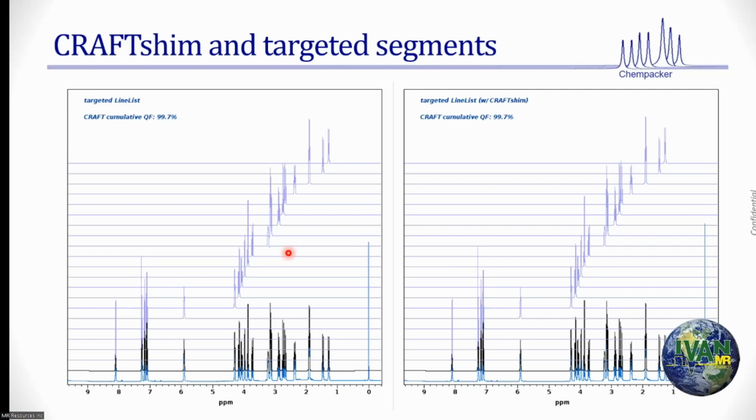I want it to be strychnine because somebody took a bottle of strychnine, made a sample, and ran a spectrum for me 20 years ago. I haven't run a spectrum myself, George. Somebody ran a spectrum for me. I trust that person. So I am biased. I want that to be strychnine. So I'm directing this to be. So we have to be very careful.